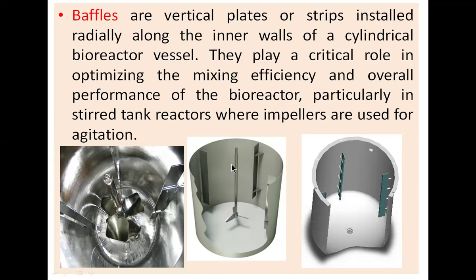Baffles are vertical plates or strips installed radially along the inner walls of a cylindrical bioreactor vessel. They play a critical role in optimizing the mixing efficiency and overall performance of the bioreactor, particularly in stirred tank reactors where impellers are used for agitation. I hope you understood the position of the baffles, and where exactly these baffles are present and for what purpose.